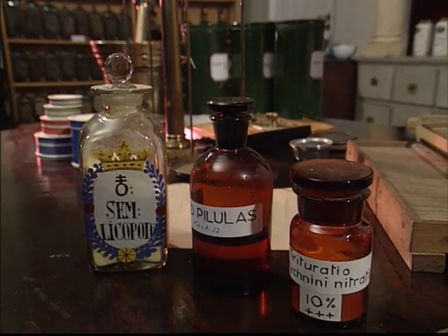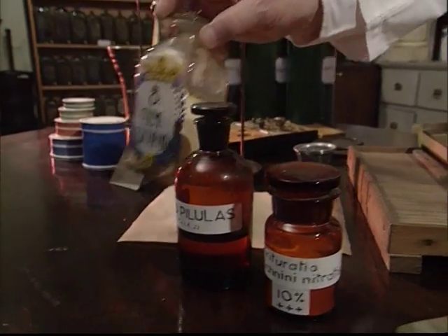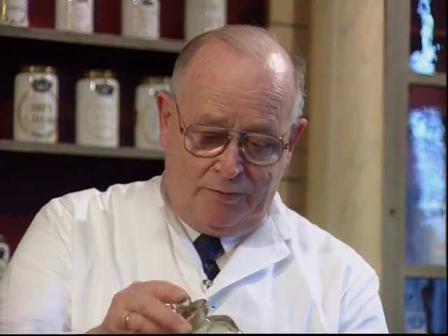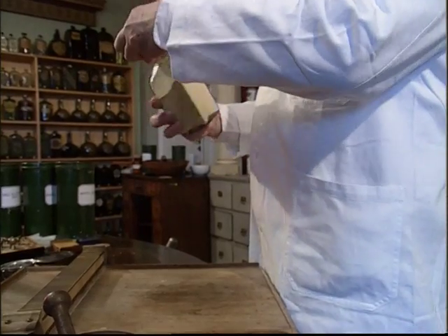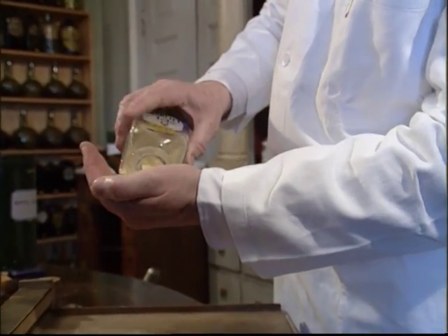Let's now see our conjurer perform a little magic with his witch powder, Lycopodium. When you roll pills, they have to be coated with witch powder, so they won't stick together. It's a very, very lightweight powder. And if you're wondering why it's called witch powder, well, just watch closely and you will see.